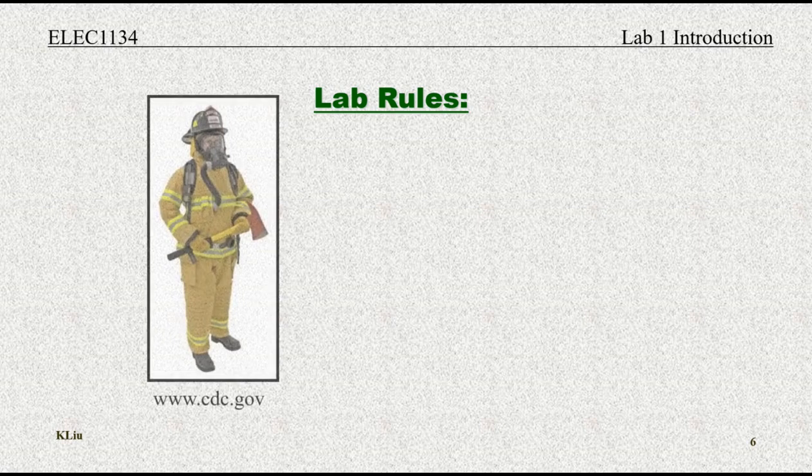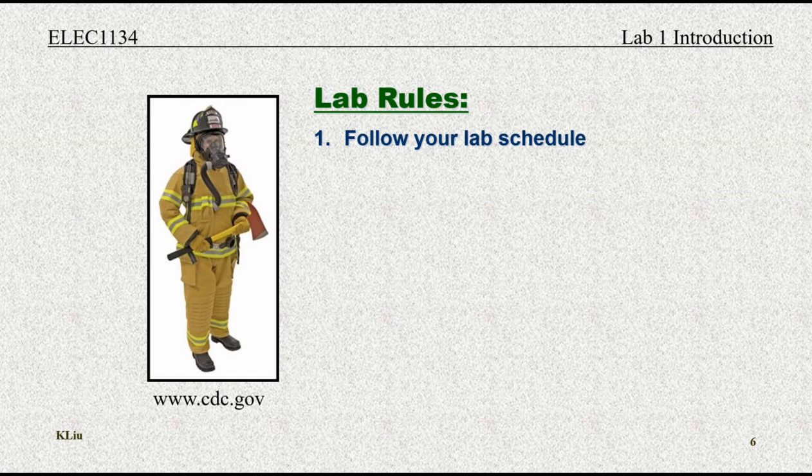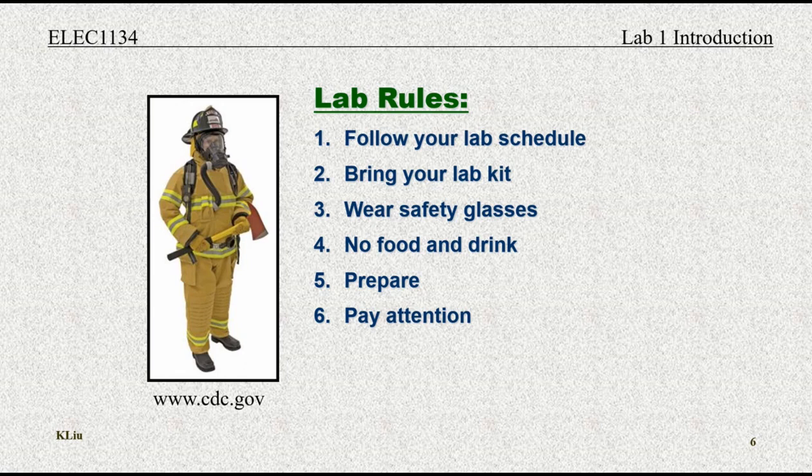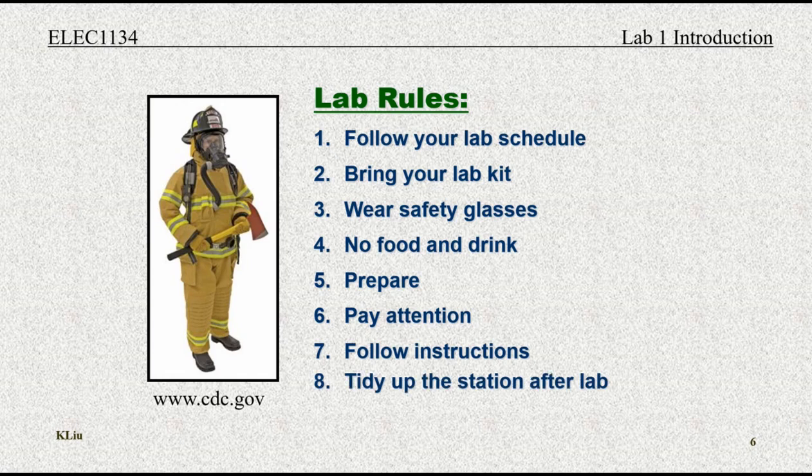We need to protect ourselves in the lab. But do we need to dress up like the man in the picture? Not necessary. Our lab rules are: 1. Follow your lab schedule. 2. Bring your lab kit. 3. Wear safety glasses. 4. No food and drink. 5. Prepare. 6. Pay attention. 7. Follow instructions. 8. Tidy up the station after lab. We believe every one of you will follow the rules to keep us safe in the lab.